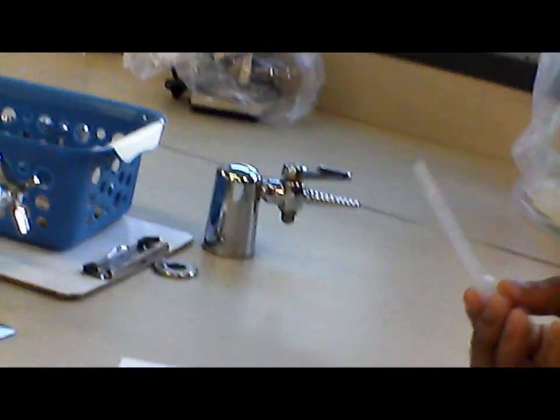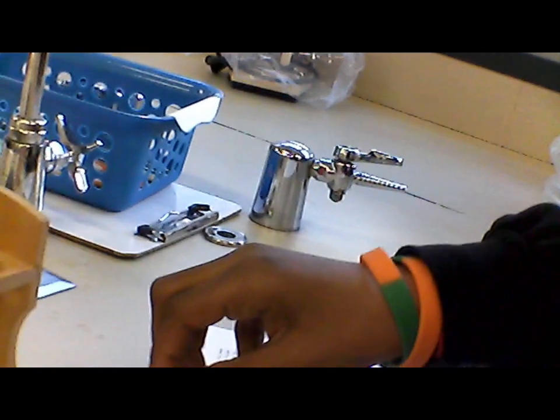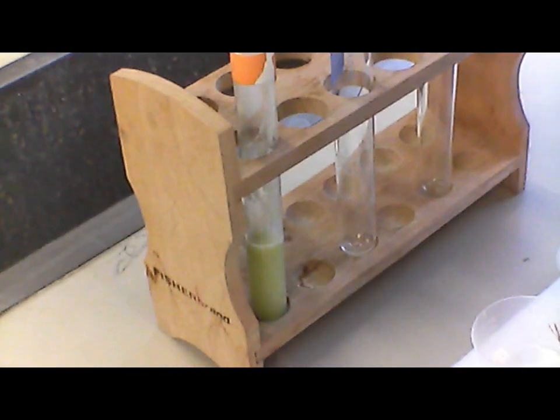Alright, next we gotta do the hydrogen peroxide. Which is 10 drops? Okay, HP. 1, 2, 3, 4, 5, 6, 7, 8, 9, 10. Alrighty. Oh, okay, look at the bubbles.